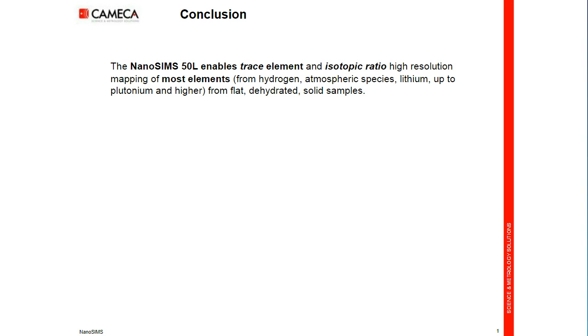It also, as we have seen, permits this analysis over depth profile information. And this instrument is really used in a very large diversity of applications.